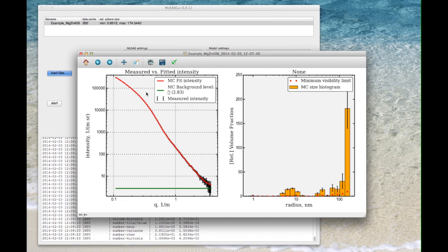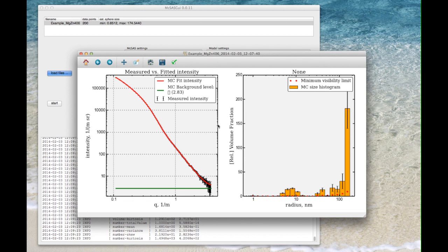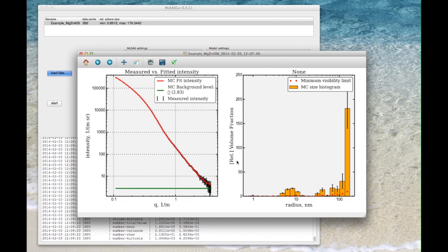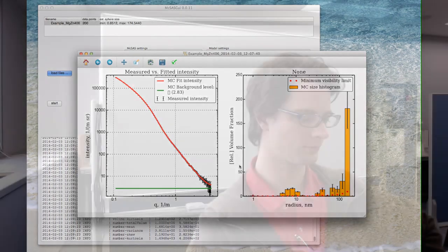As you can see the Monte Carlo method using spheres fits quite nicely to this data. The resulting size distribution is shown here on the right hand side with the radius on the horizontal axis and the volume fraction on the vertical axis.